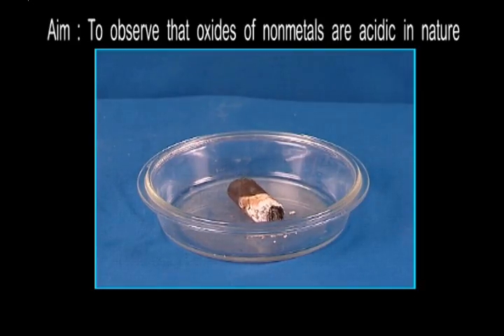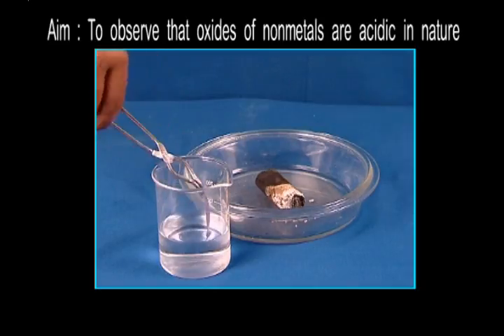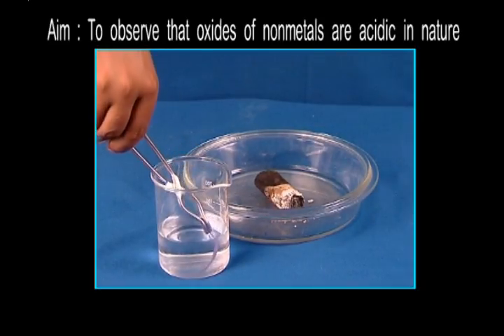Let's try this out with an activity. Here's a piece of burning charcoal. In this glass of water, we will wet the blue litmus paper. Watch our next step carefully.